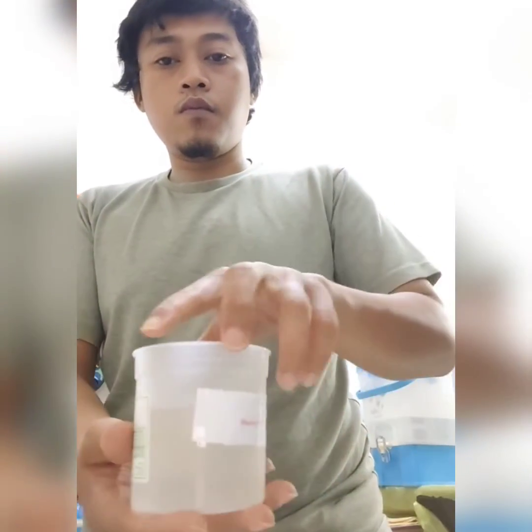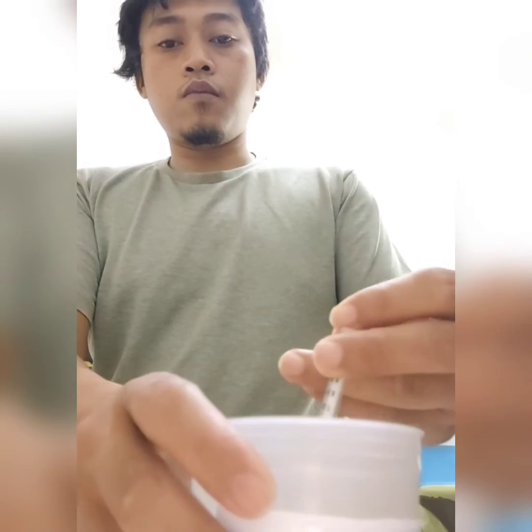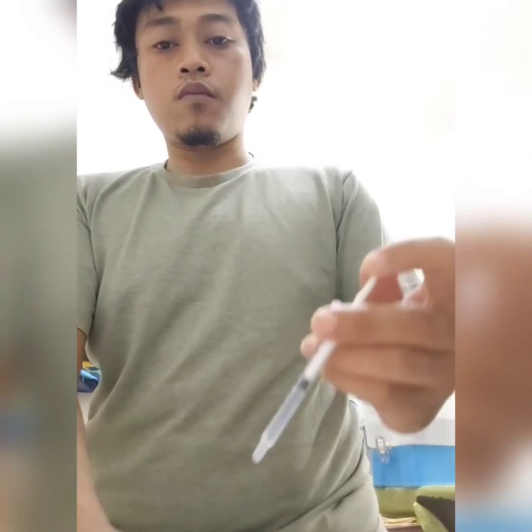Then, fill the syringe with different quantities of aluminum sulfate according to the task, which for this task I use 10, 20, 30, 40 and 50 milliliter, and we put them in the different beakers.